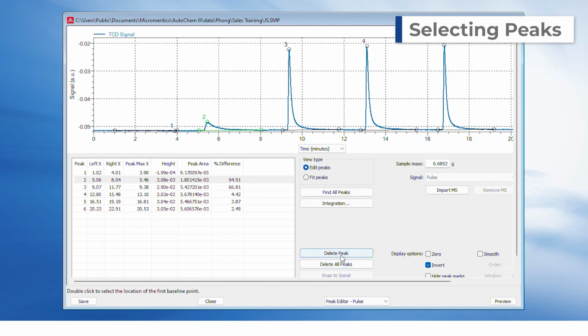These last peaks represent the quantity of the gas detected after the sample is saturated. The areas of these peaks represent the total volume of the loop, since no adsorption occurred. We expect them to be identical because the same loop was used for each injection.